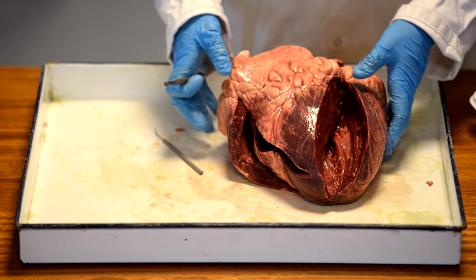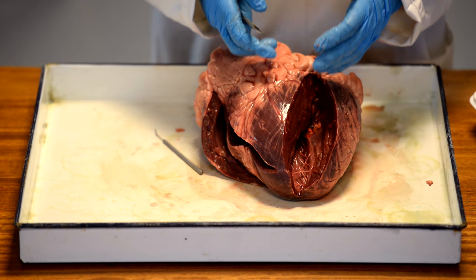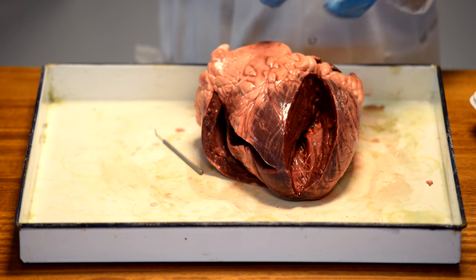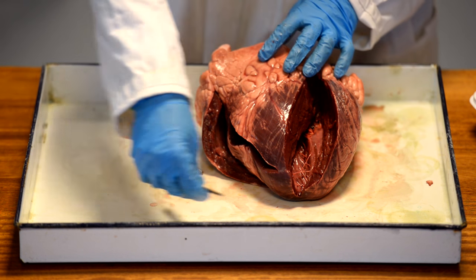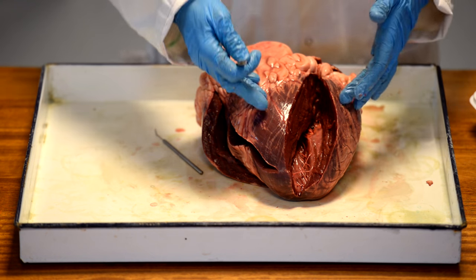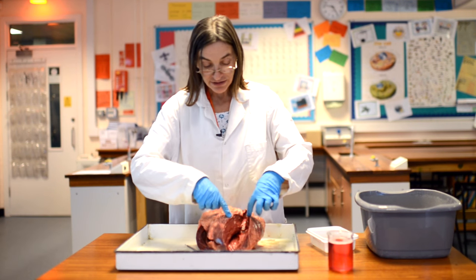This side, and remember this is from an ox, this is a big animal, this side has to have enough strength when it contracts to pump the blood all the way around the body. There is no other pump. The blood returning to the heart is moving only because the heart beats. This is the only thing that moves that blood. Now we've opened up the left-hand side of the heart.